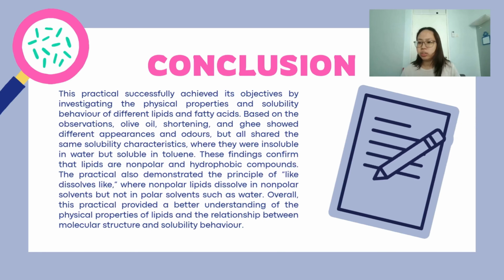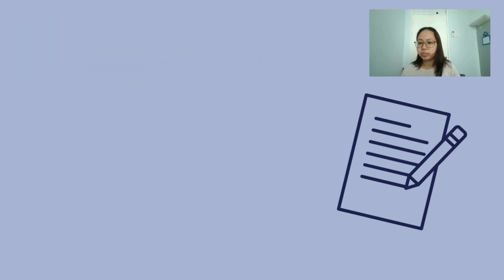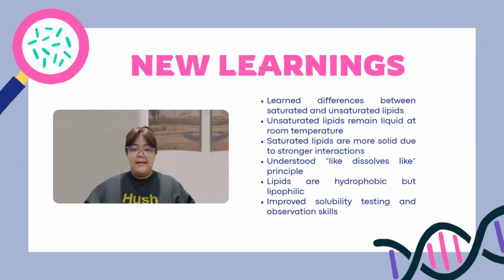This practical also demonstrates the principle of like dissolves like, where non-polar lipids dissolve in non-polar solvent, but not in polar solvents such as water. Overall, this practical provides a better understanding of the physical properties of lipids and the relationship between the molecular structure and the solubility behavior. From this practical, I learned that the structure and saturation of lipids affect their physical properties.